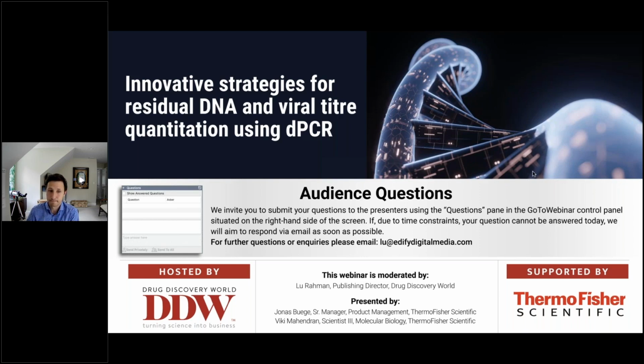Okay, lovely. Thank you for that answer. The next question is, is sample prep extraction required? I would say yes and no. I think Vicky tried to speak a little bit to that, right? In most cases, most customers that I see in the field don't need sample extraction. Dilutions are sufficient in most cases. There are samples that contain so many inhibitors with a low abundance target that diluting enough is not possible.